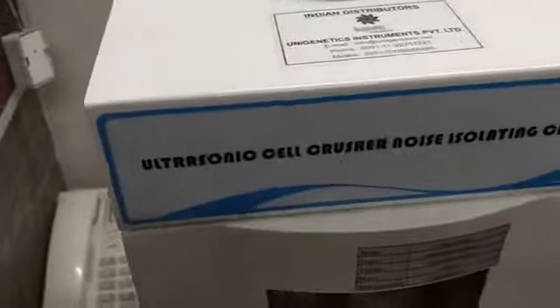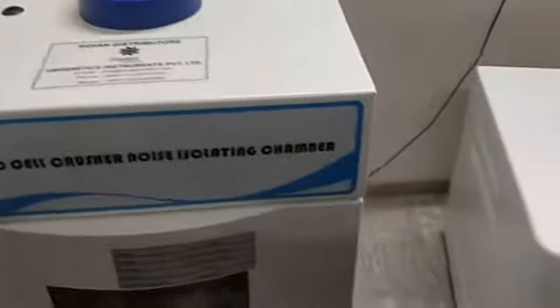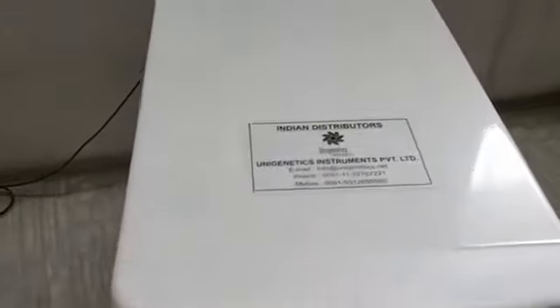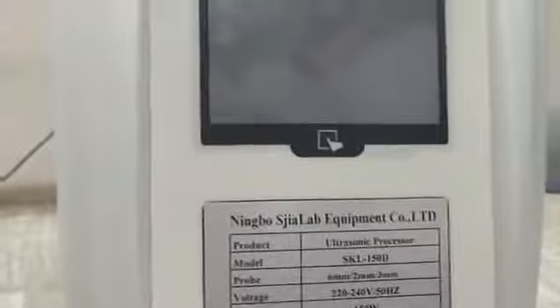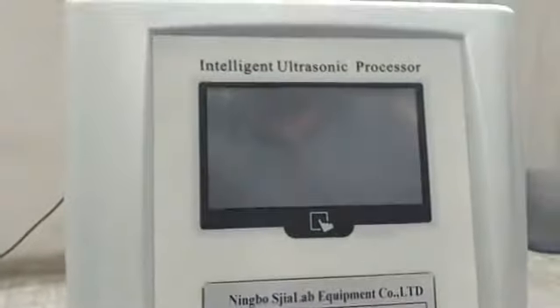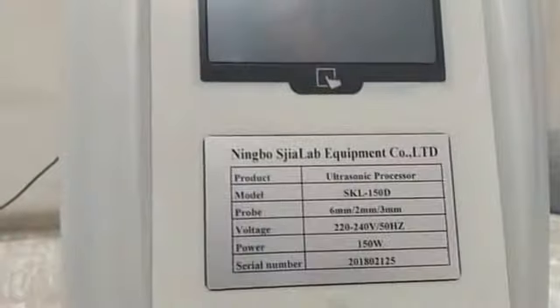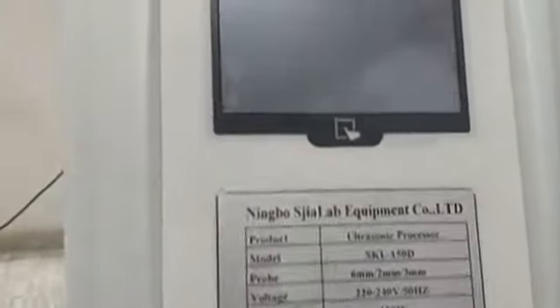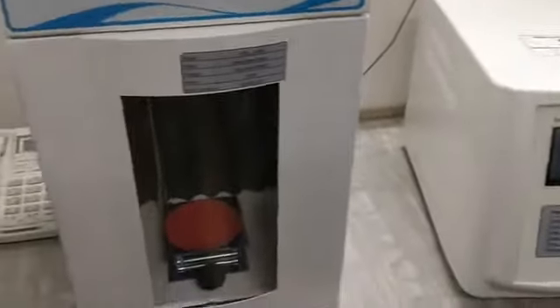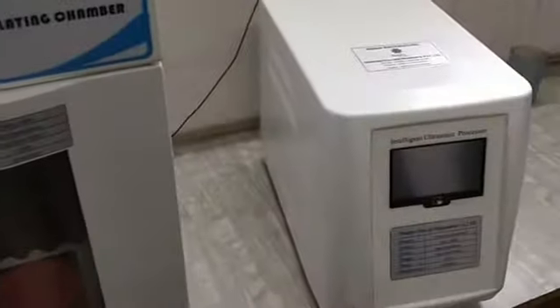Though this machine is from China, we can say that during our past 3-4 years experience, this is an excellent machine. As of March 2018, we are having around 25 installations all over India. This is a very simple plug-and-play machine, but still we are giving a small demo video to help the customer in running the machine first time.